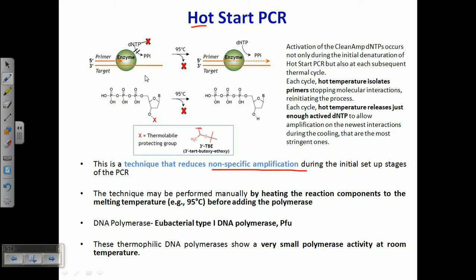This kind of wrong or mis-pairing of the primer with the template means that when PCR starts to amplify, it will amplify non-specific or unwanted regions of the DNA. We don't want amplification of those regions, but it will start amplifying them due to the mis-incorporation of the primer with the target DNA.